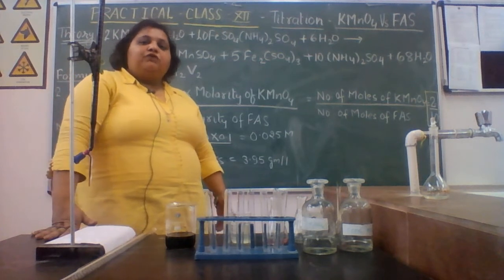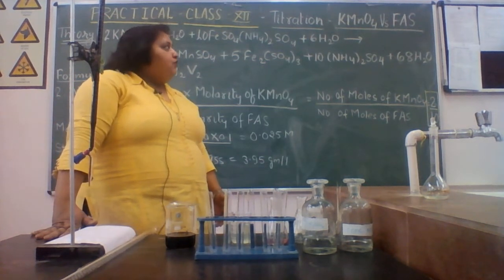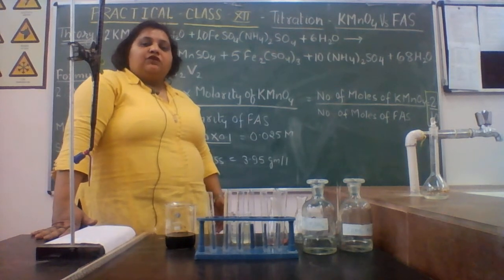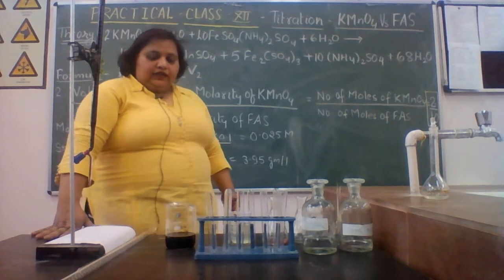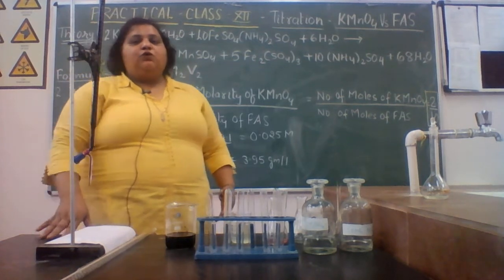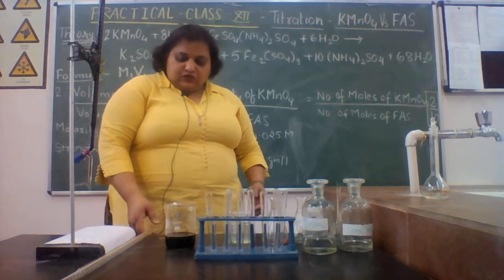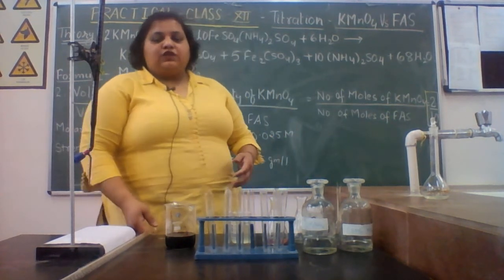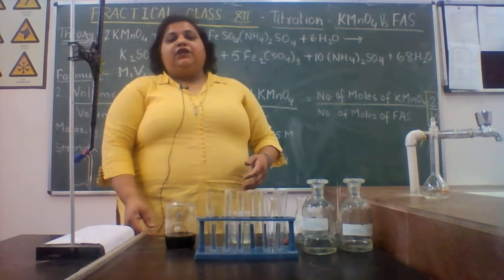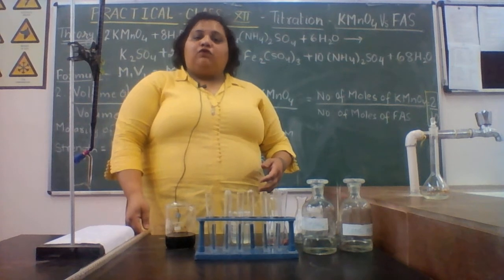We are going to perform the titration of KMnO4 with ferrous ammonium sulfate, also known as the Mohr's salt. In the previous video, I have shown you the method of preparation of standard solution, and today I am going to use the same solution for the determination of the strength of unknown KMnO4 solution.